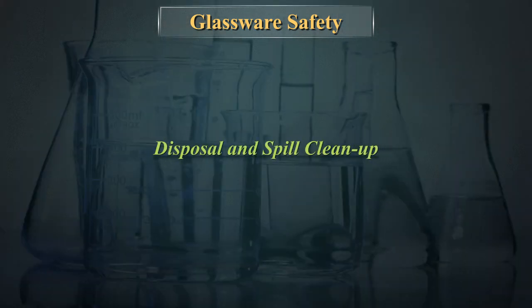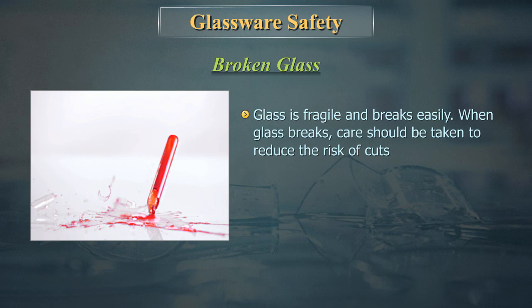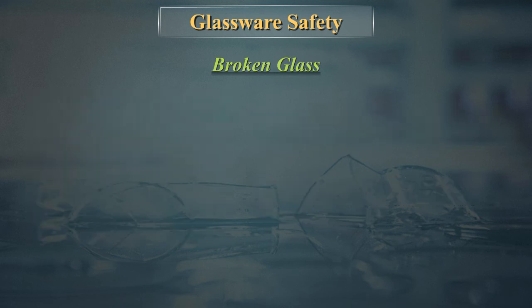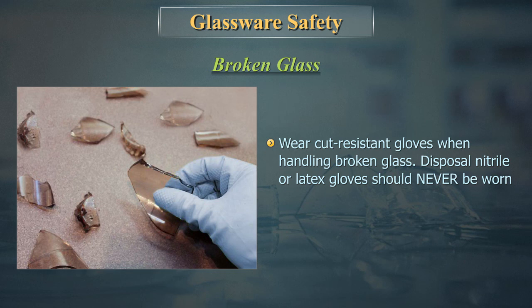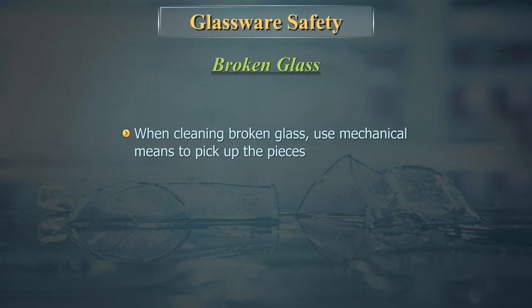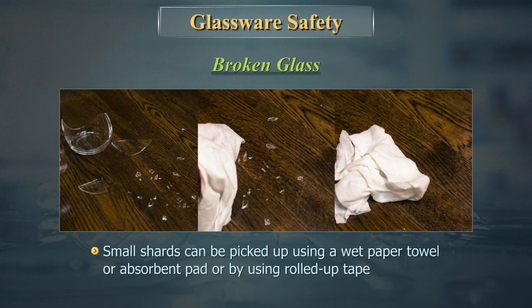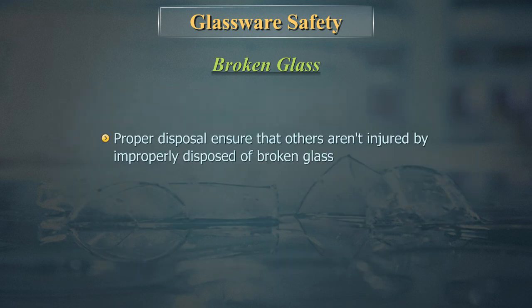Broken glass is fragile and breaks easily. When glass breaks, care should be taken to reduce the risk of cuts. If something is falling, let it drop — catching it may cause the glassware to break in your hand. Wear cut-resistant gloves when handling broken glass; nitrile or latex gloves should never be worn for disposal, as glass will cut through those gloves. When cleaning broken glass, use mechanical means: tongs, tweezers, or forceps for large pieces, and a wet paper towel, absorbent pad, or rolled-up tape for small shards. Proper disposal ensures that others are not injured by improperly disposed-of broken glass.